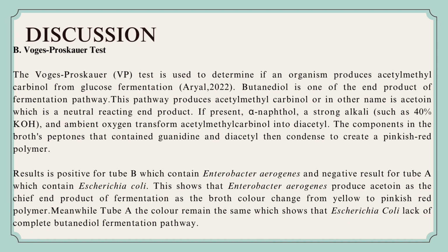Meanwhile, in tube A the color remained the same, which shows that Escherichia coli lacks the complete butanediol fermentation pathway.